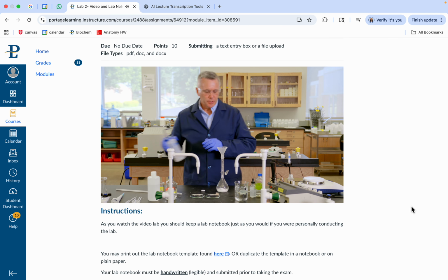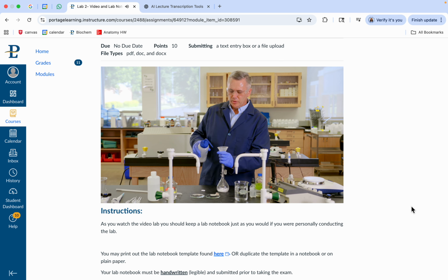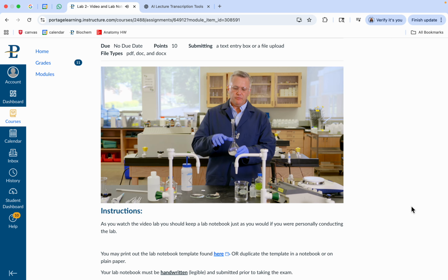There we go. And of course, one of the things we want to do is go ahead and add some distilled water to the funnel. Any solid that's in there, that'll allow us to get it down into here. And then also we can pull this out, maybe, and then add a little bit to the neck of the funnel. What we want to do now, now that we've gotten the solid in there, is fill this up part of the way.